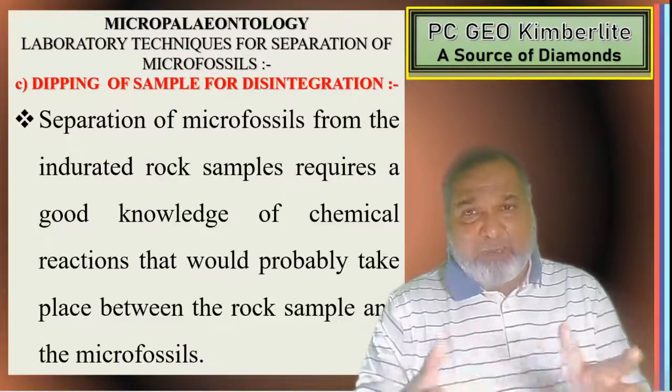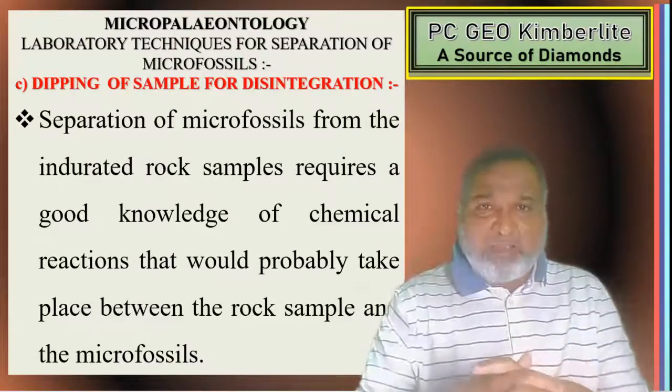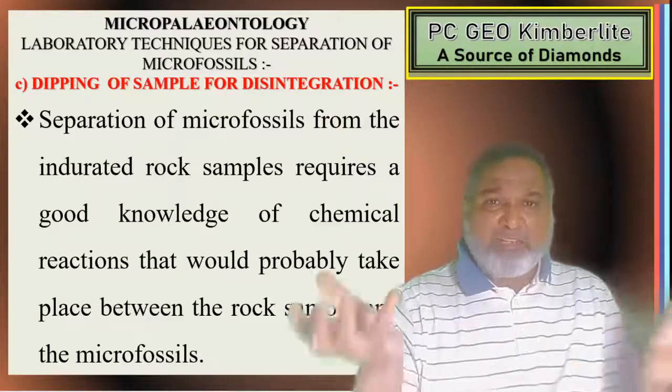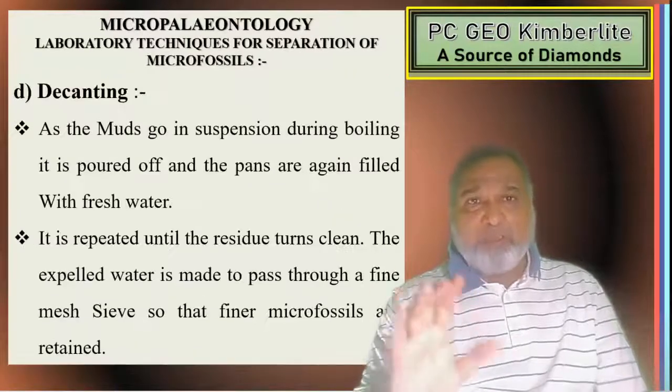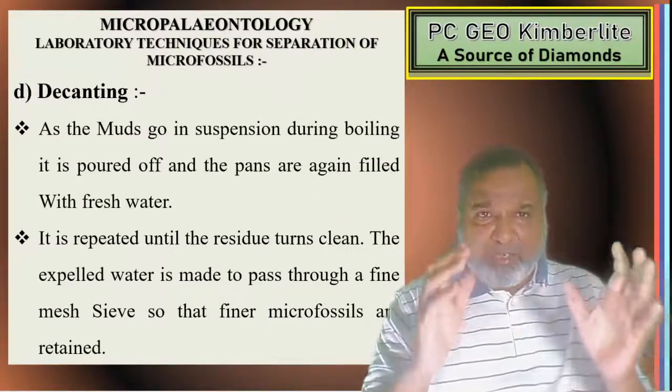Otherwise, it should not happen that once you put in that chemical, the microfossils are completely dissolved or disintegrated. That should not happen, so care has to be taken at that time.